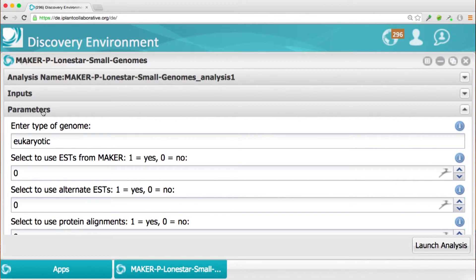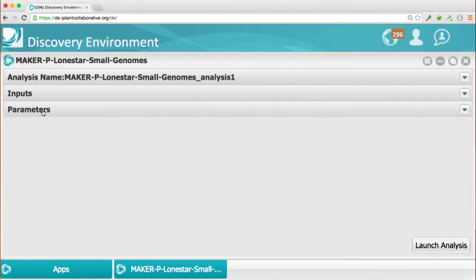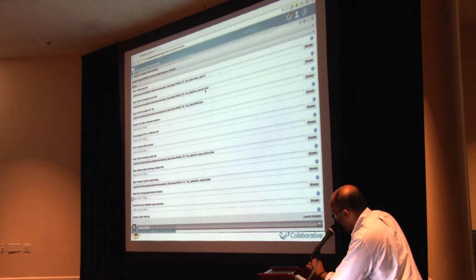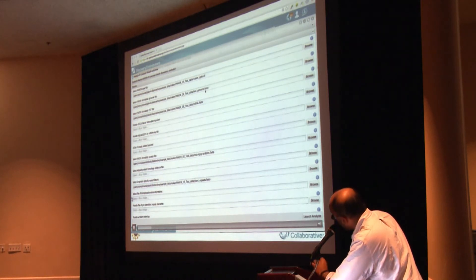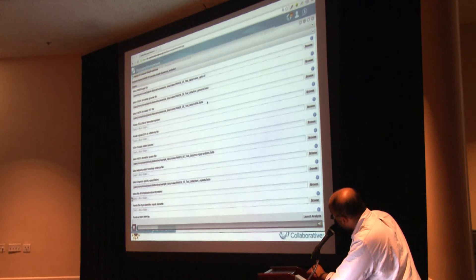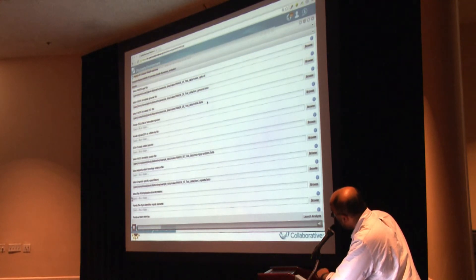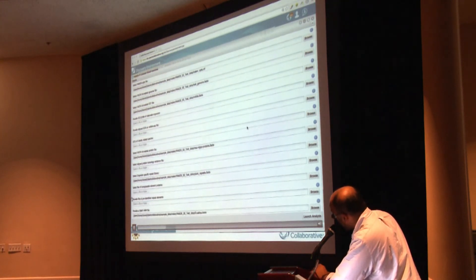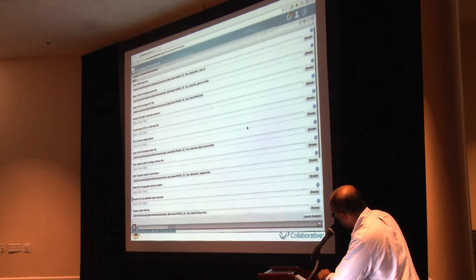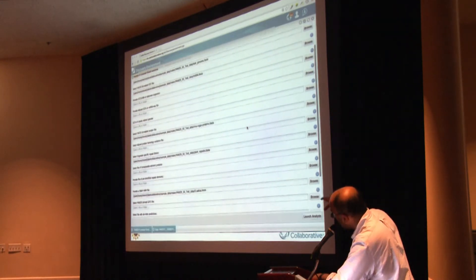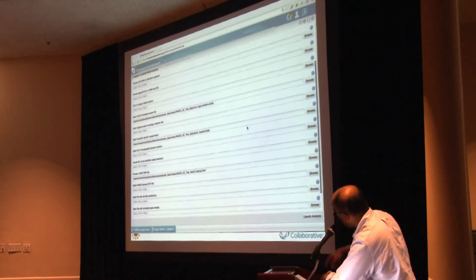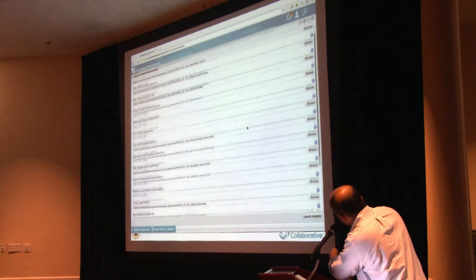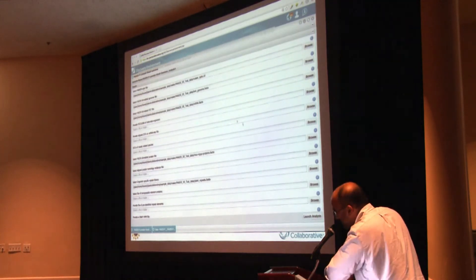So this is very quickly, that's a demo run. So I just filled up all the different entries within the form, selected my own MAKER Ops file in this case, and defined the genome file, and the protein and mRNA and EST files and all that stuff. And once you select all that options, right at the bottom right there, if you see, there's a button called Launch Analysis.